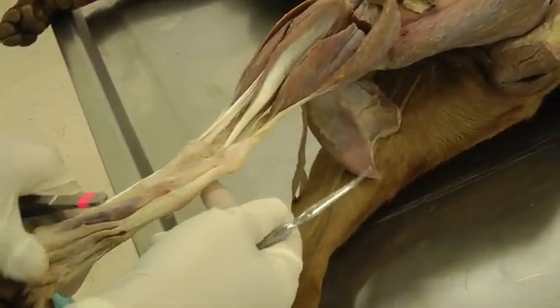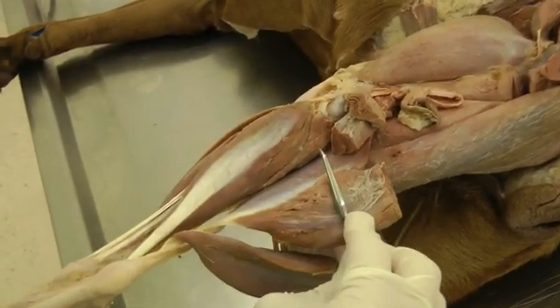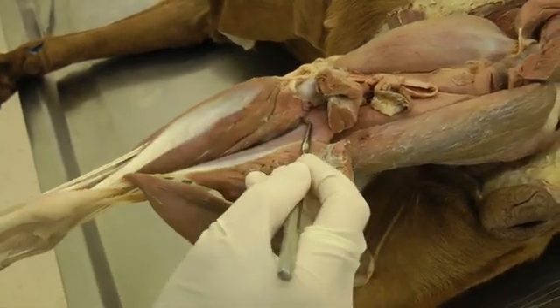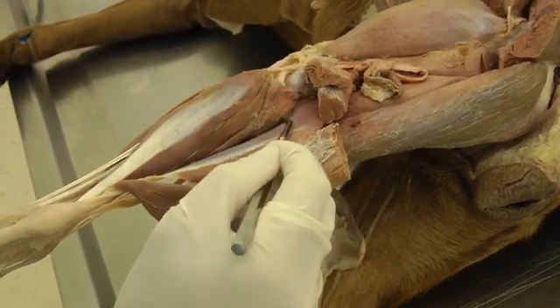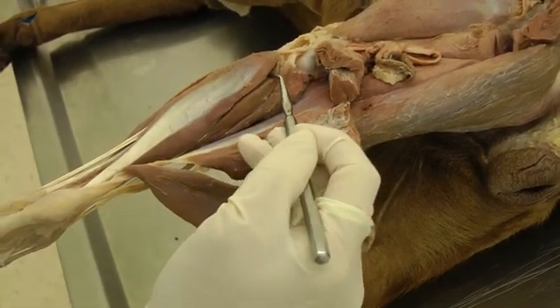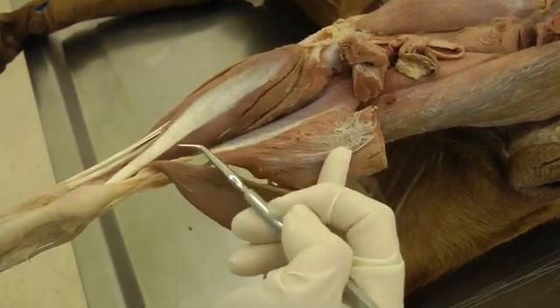Now we have the deep digital flexor muscles. We've reflected the other structures to see the deep digital flexors. There are two heads to the deep digital flexor, and then we have the popliteus muscle. Popliteus is the most proximal of the group from this angle, and then you have the medial head of the digital flexor right here — sometimes they're a little hard to differentiate. Popliteus is here, then the medial digital flexor, and then the lateral digital flexor.